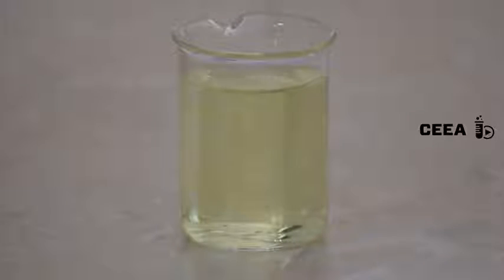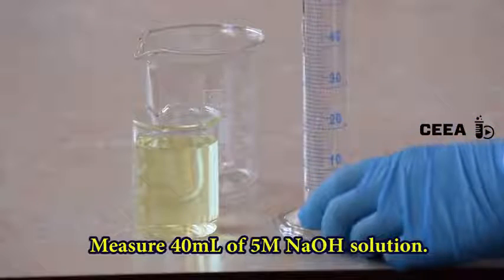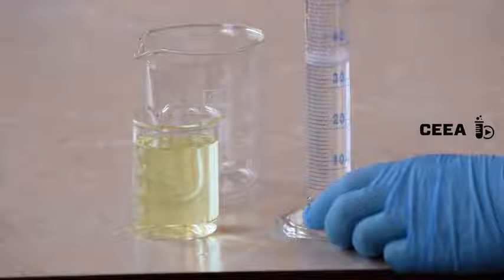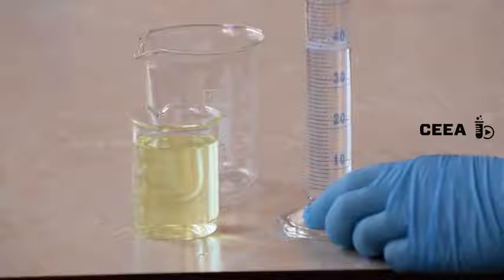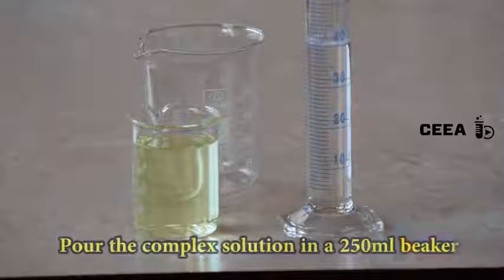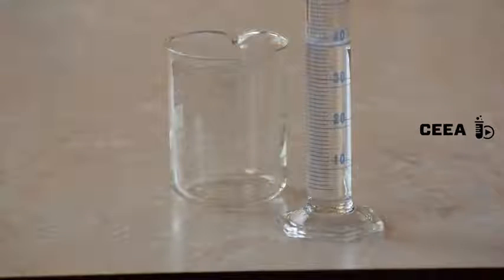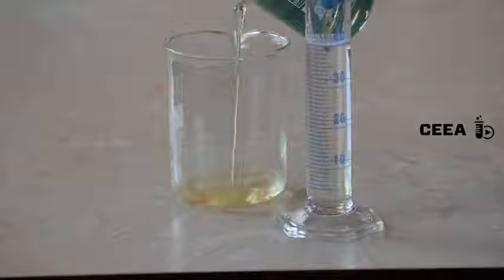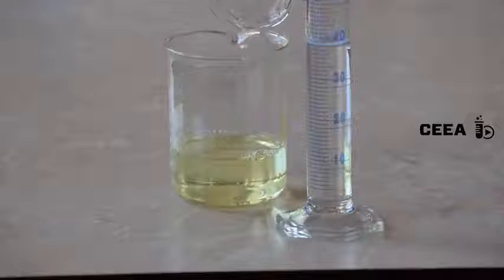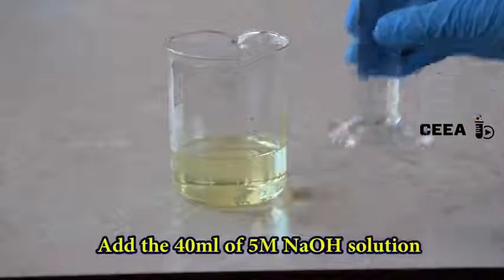Observe the yellowish color of the complex solution. Measure 40 milliliters of the third solution, the 5 molar sodium hydroxide. Transfer the complex solution in a 250 milliliter beaker and add the alkaline solution to it.